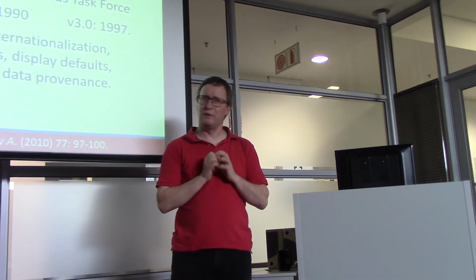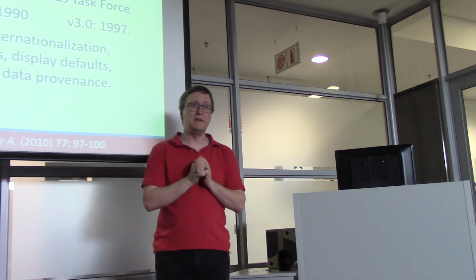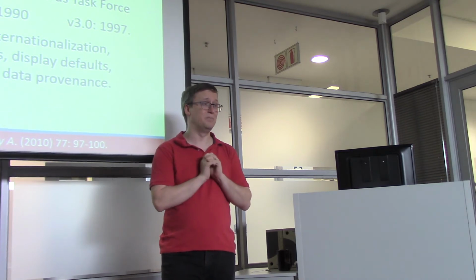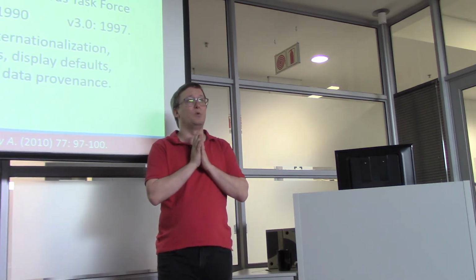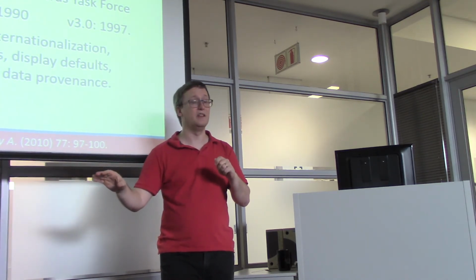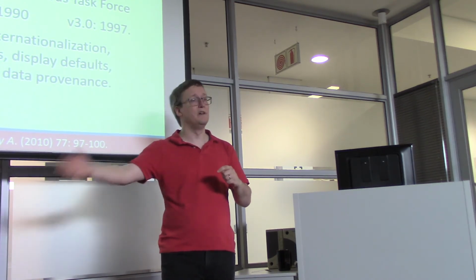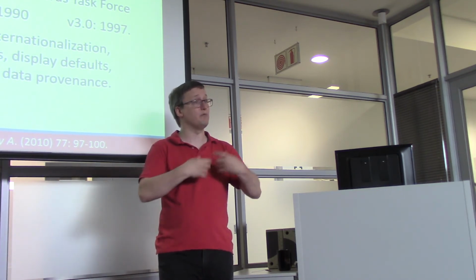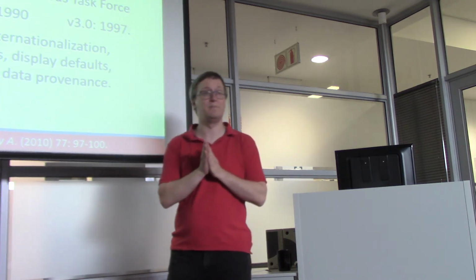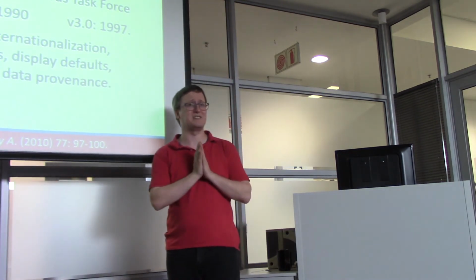Before we wrap up, I think it's really important to remember some practical realities, and one of these is the FCS file. Frequently, when you're working with flow cytometry data, it's going to be made available to you in FCS format. Even if you're working in a particular field where people have previously published flow cytometry data sets, they'll frequently make those available to you through repositories. So you can download FCS files from somebody else who has done a related experiment and reanalyze those as part of your own. Kind of getting free experimental data. There's a lot of opportunity for that. In fact, I think our lecture, is it tomorrow, is about databases and repositories. So we'll be talking about this topic quite a lot more.